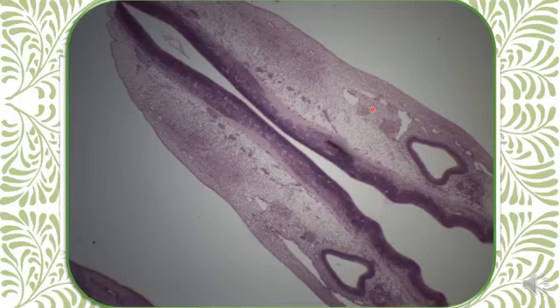Caudal to the ear vesicles, 9th and 10th cranial nerve, while anteriorly, acoustico-facialis ganglia.